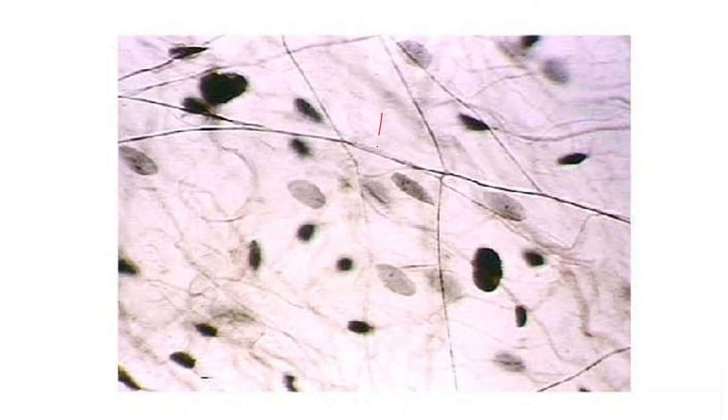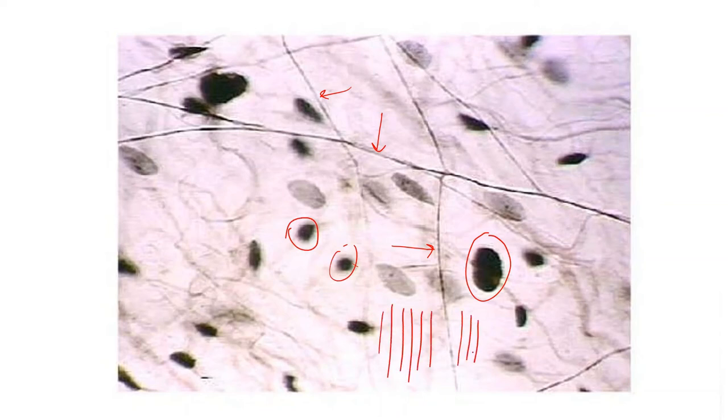I see here the elastic. I can't even see any collagen fibers because they're washed out by the background. I see the nuclei of the fibroblasts, and I see lots and lots and lots of matrix or ground substance in between the cells and the fibers. So areolar tissue, function, protection, bubble wrap, location, wrapping around organs to give them protection.